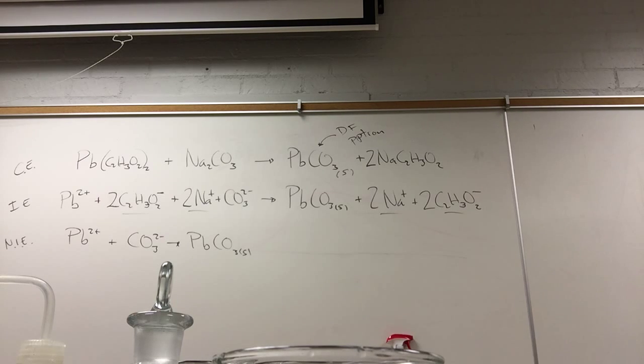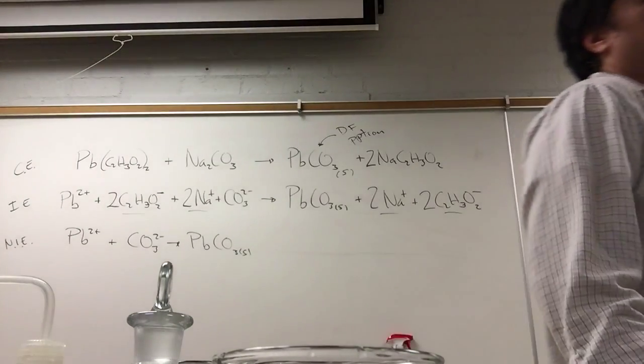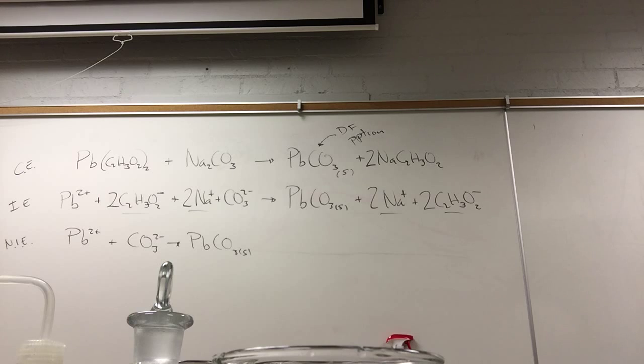We're going to do this for each of the 15 reactions, I think we have. Don't write this on the report sheet. You'll see on the report sheet there's room to write these. They give you a box for the observations. They give you 3 lines for the complete, the ionic, and net ionic equations. I want you to do everything in your lab notebook.